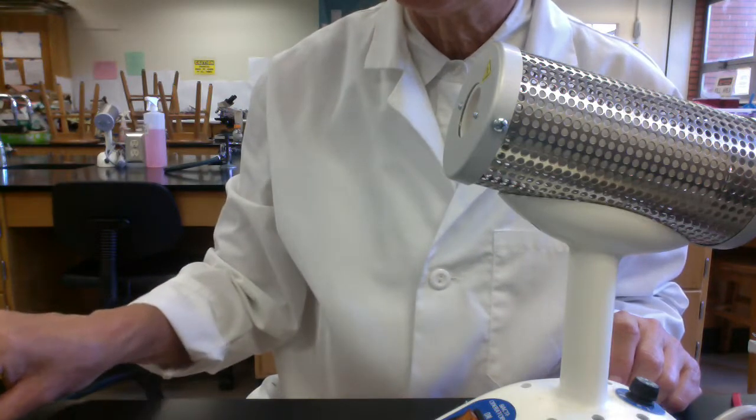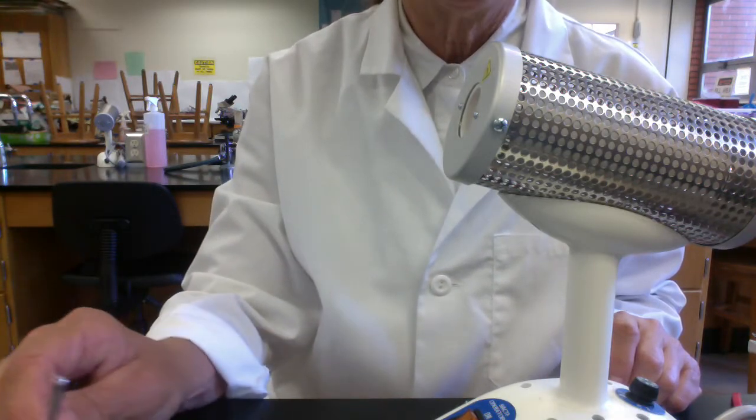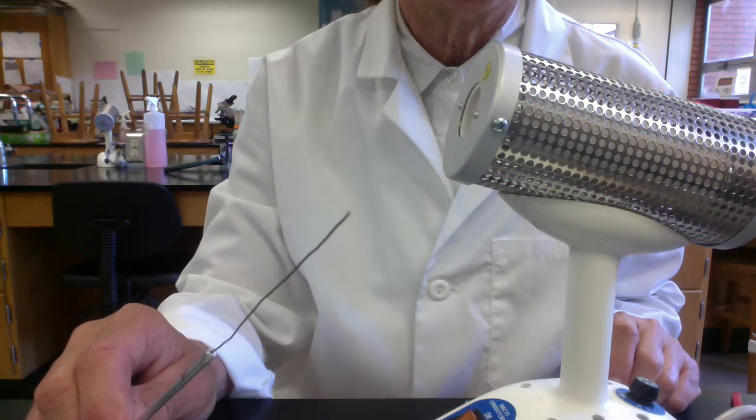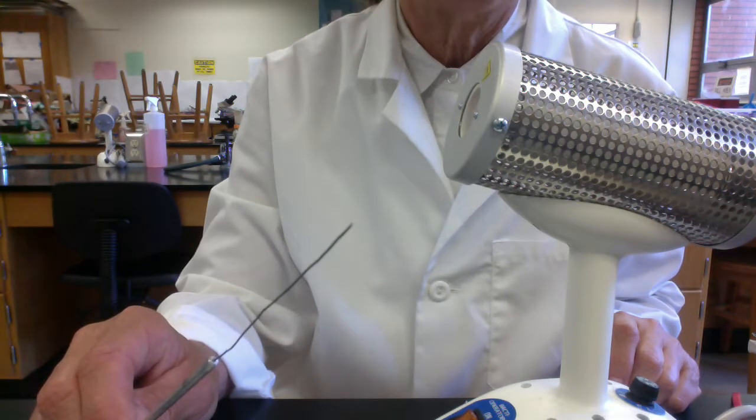Another transfer instrument that's used often is the inoculating needle. We'll be using this most often when we're stabbing agar deeps to get our microbes to grow anaerobically.